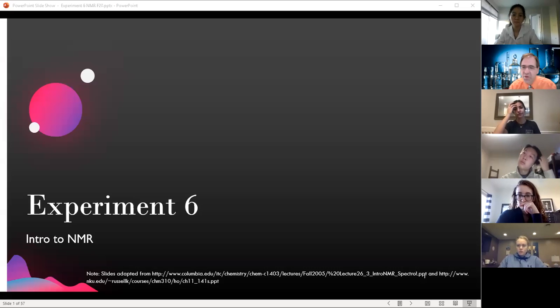So today we're going to start talking about NMR. This is our last of our kind of theory talks. Then next week we'll start getting into reactions and using the things that we've been talking about with IR and NMR and Spartan and things like that, and applying it to some actual experiments that we're going to do. But today I want to give you the background on nuclear magnetic resonance spectroscopy, as well as some things about how to interpret the spectra.